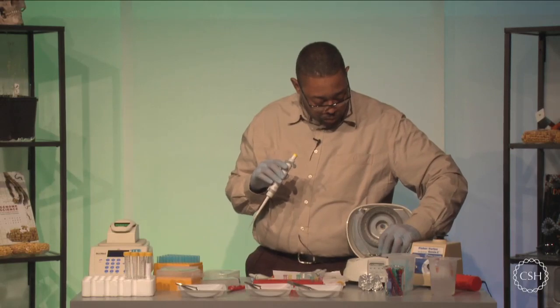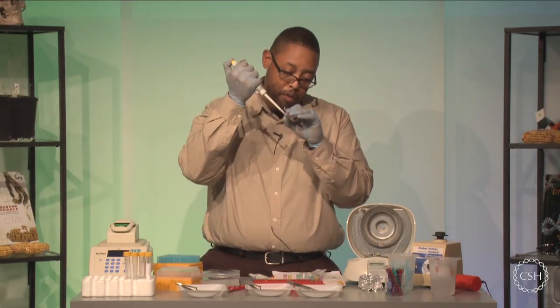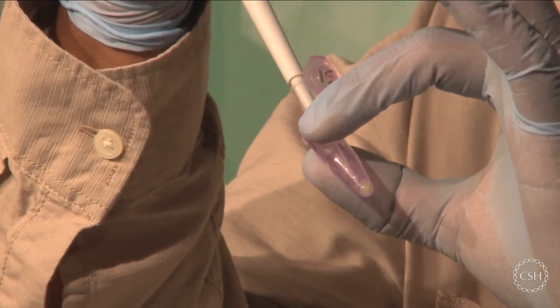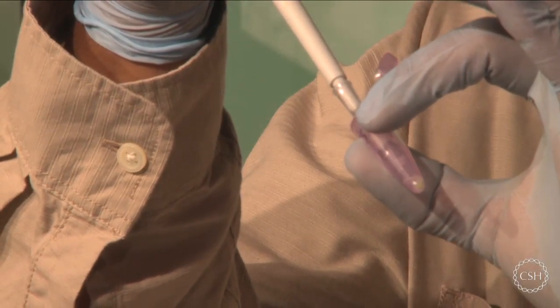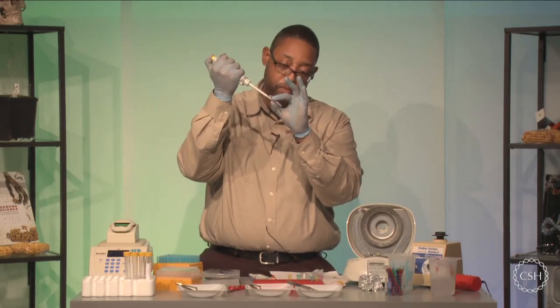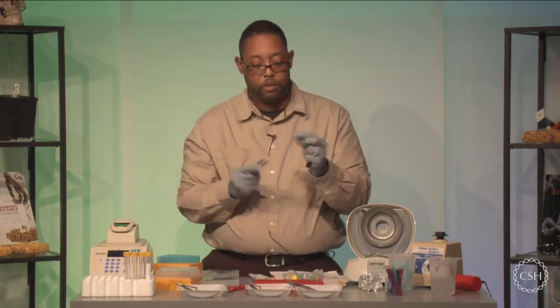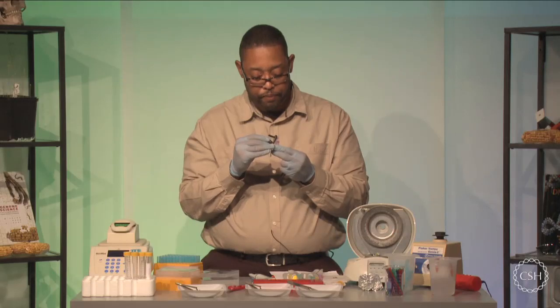So I'm going to take my sample number 1 here, and I'm going to transfer that into a new test tube. Remember, you just want 90 microliters of the clear liquid. You don't want any of that contaminating material at the bottom. If you notice that you're starting to get some of that material coming up into your tip, avoid it at all costs. And transfer into a new fresh tube. I'm going to label this sample number 1, but I'm going to put an F on this one because it's my final sample. This is my plant.